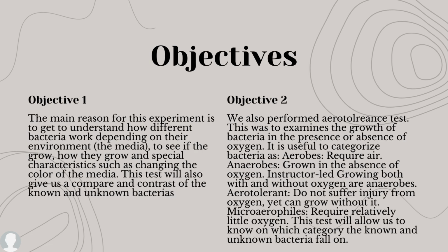The objective for this experiment was to understand how the different bacteria work depending on their media. With this, we're able to see if they grow, how they grow, and the special characteristics such as changing of color. This test will also give us a compare and contrast of the known and unknown bacteria.